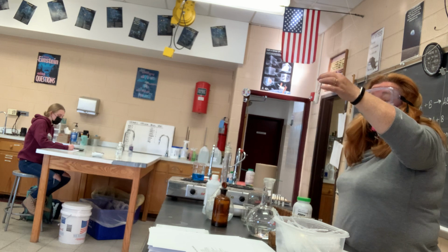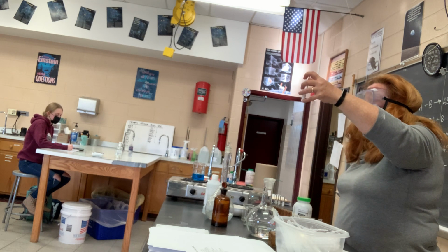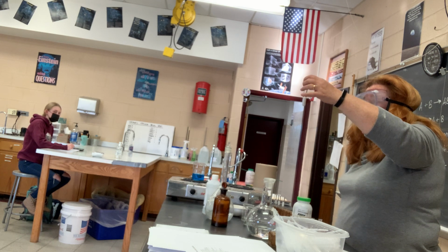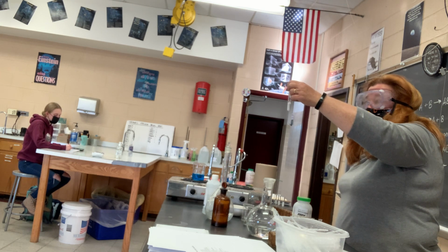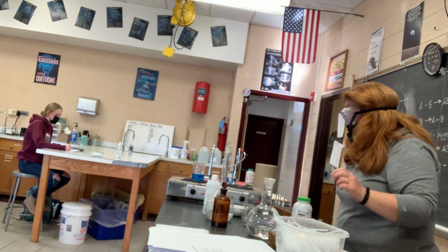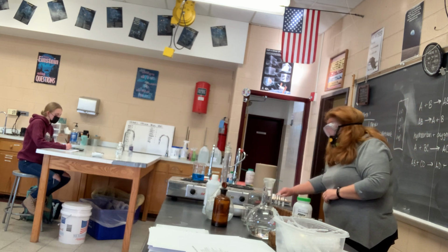That's what we called it. I'm gonna let this sit, and by the time you're out of here, all the white powder will go to the bottom because of gravity, and you'll see a clear liquid at the top. So this is a double replacement or double displacement. You had 2 clear liquids, they made a white powder. I'm gonna put that here. That was part E. I'm gonna jump back to part D.